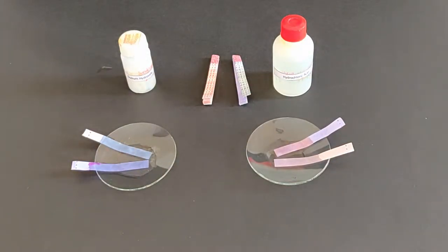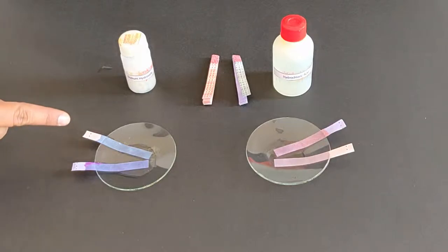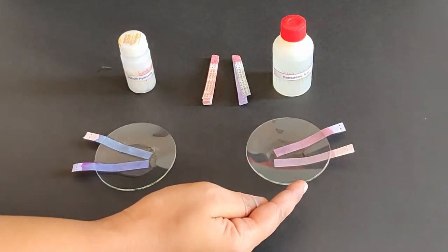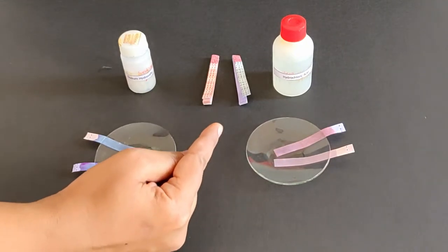You will notice, in the sodium hydroxide watch glass, the blue litmus paper remains blue in colour, while the red litmus paper has turned blue. On the other side, the red litmus paper remains red in colour and the blue litmus paper has turned red.